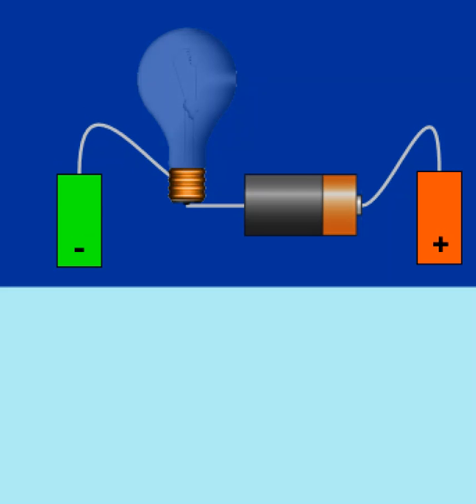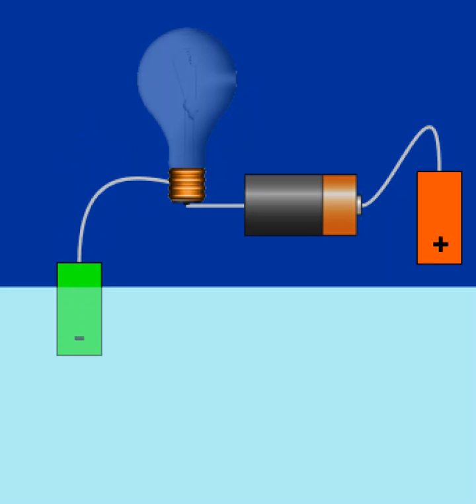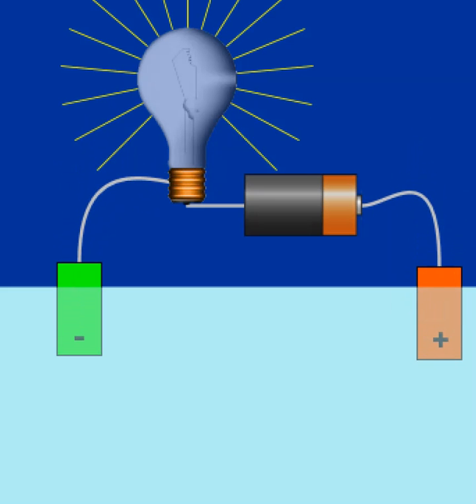So this is my 1 molar sodium chloride. Let's put our electrodes in, and we get a very bright light. So unfortunately this light bulb doesn't turn yellow. We just get those lines around it, and they're really long. That's about as bright as this gets.